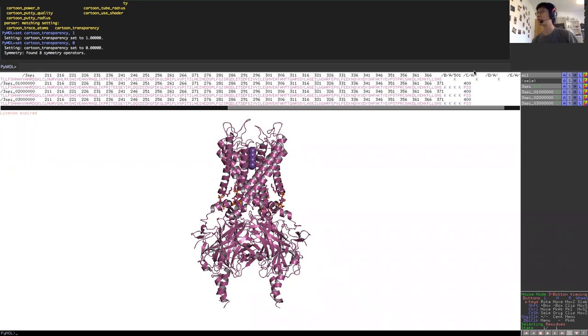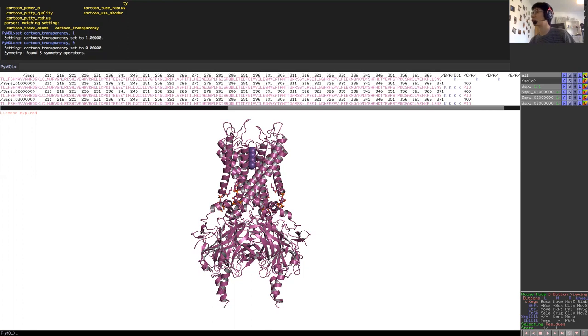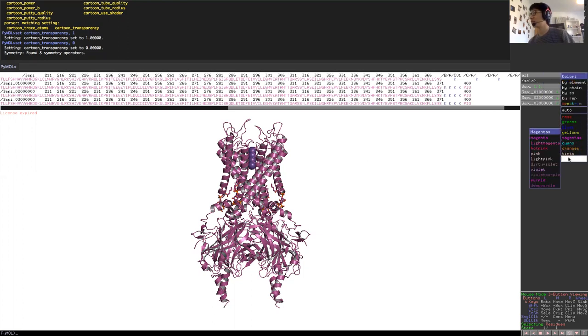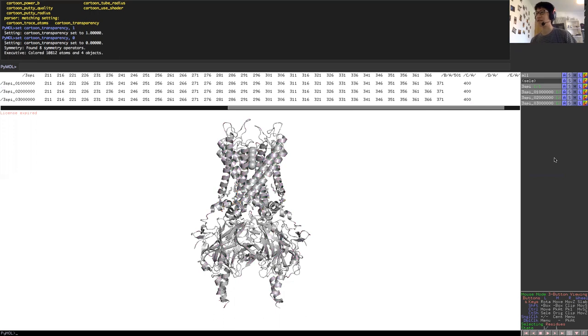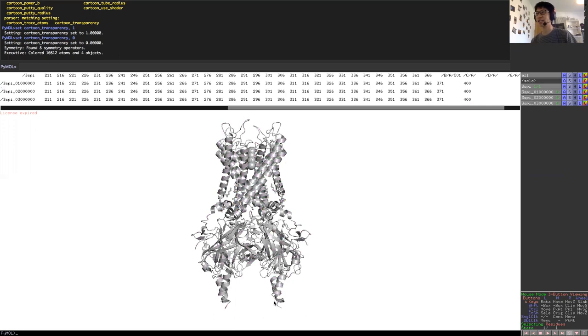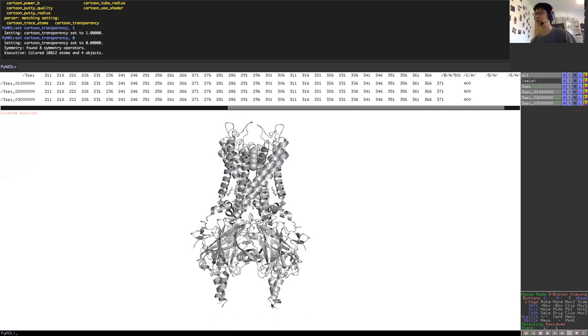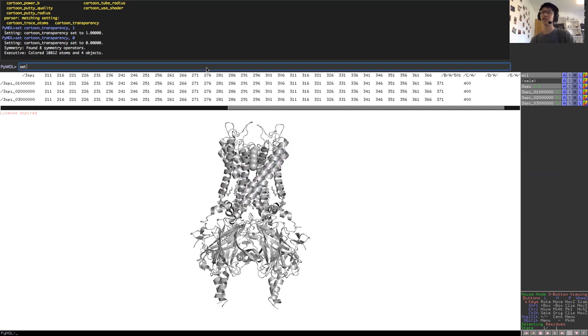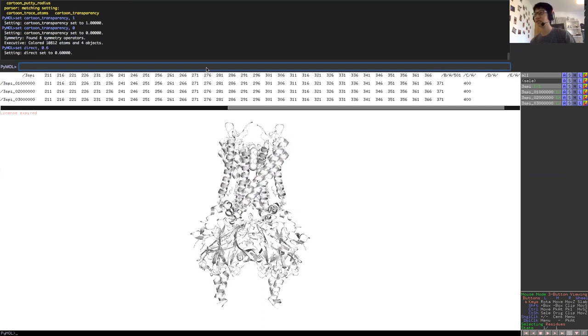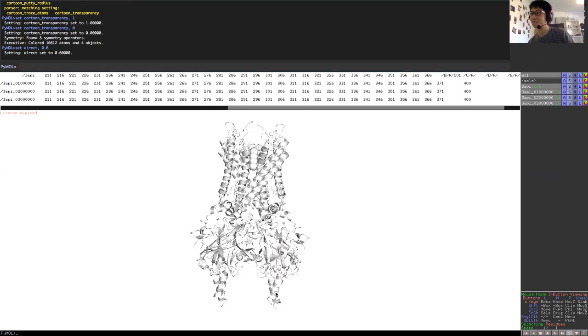First, we would like to color the protein to be white so that it's nice and clean and easy to look at. So we will go for color, grey, and we will color everything white for now. It doesn't look too white because of the way we set our lighting. So we prefer to set our light direction to 0.6. So now it's really nice and white.